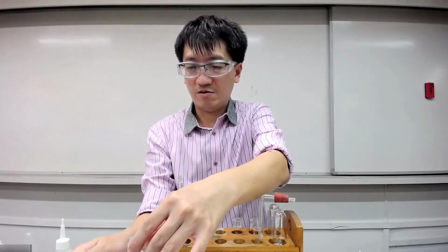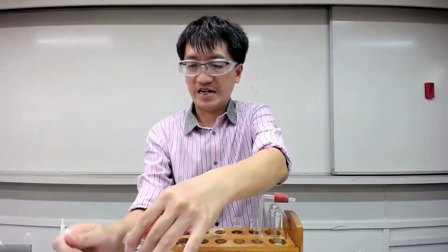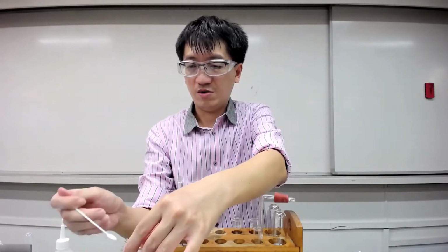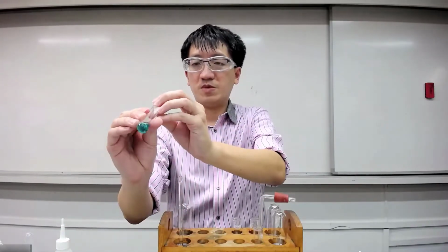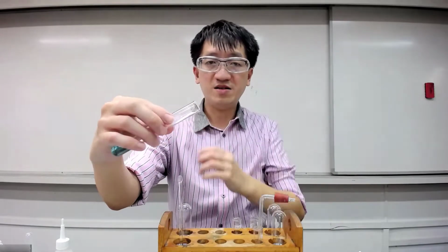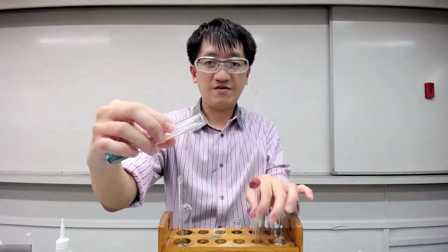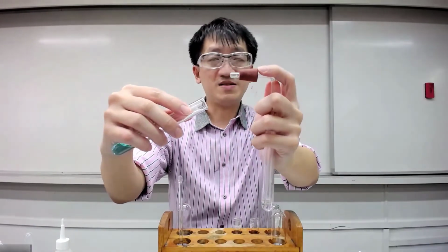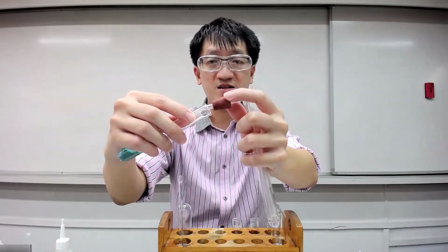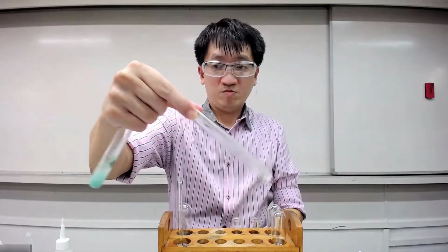So that you'll be able to get enough CO2. This is a very good technique which I hope you all can learn. So just put some carbonate at the sides. Then get everything ready. Once you are ready, in the exam, just put it in and then plug, and then you swirl.